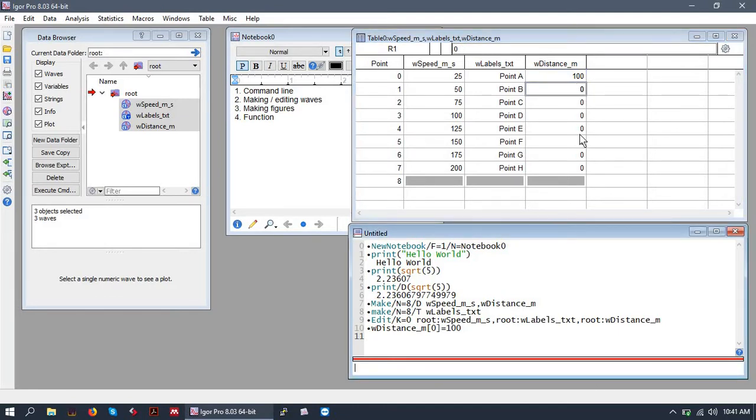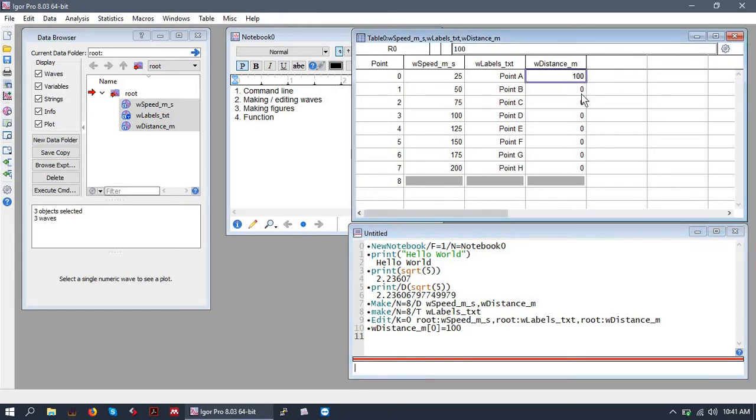Let's say I don't want to manually put in the rest of these values and let's say they're also all incrementing by 100 at each step so it should go 100, 200, 300 and so on.